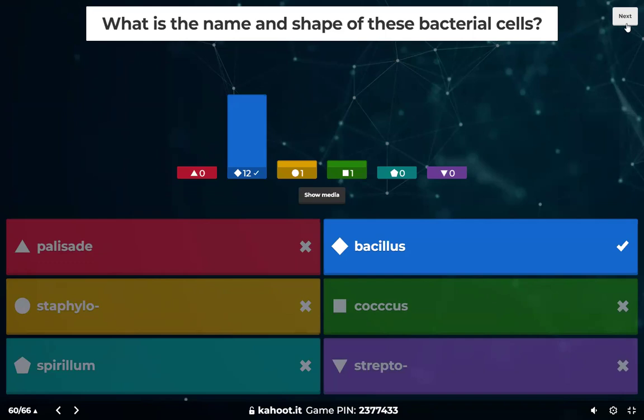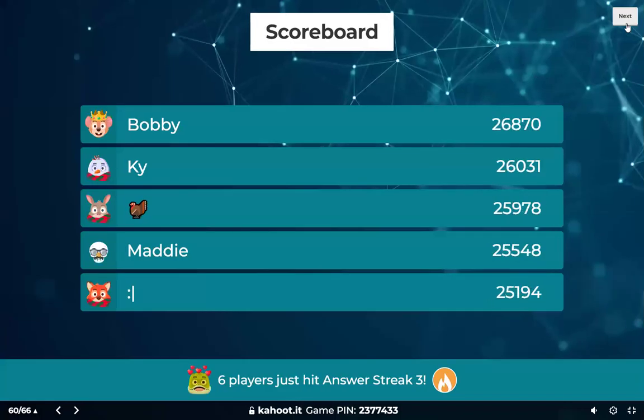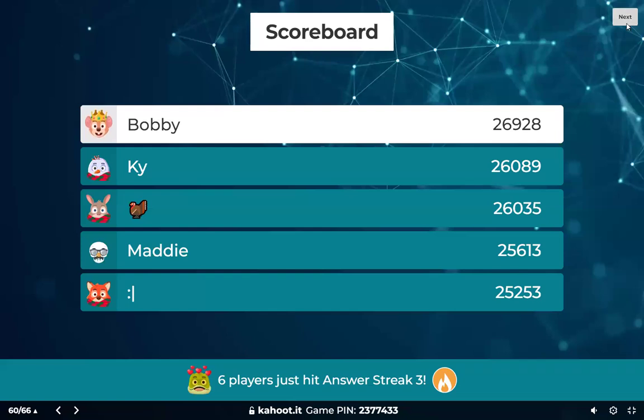The only arrangements that I have available are going to be Staphylo or Strepto. I do have Strepto arrangements. We didn't have them in our lab, but I have slides with Strepto, so do be prepared to see that if it is a possible answer. But I don't have anything else.